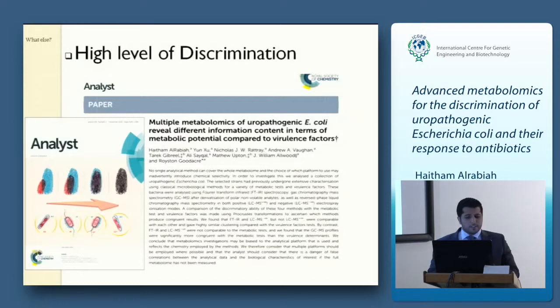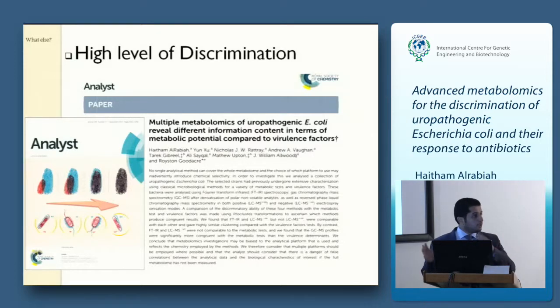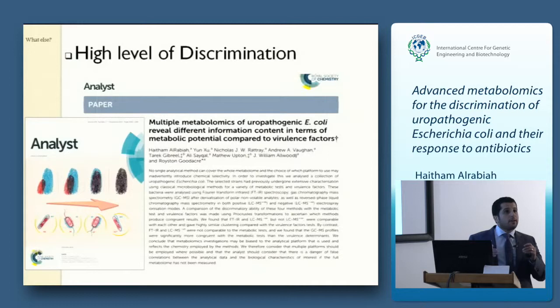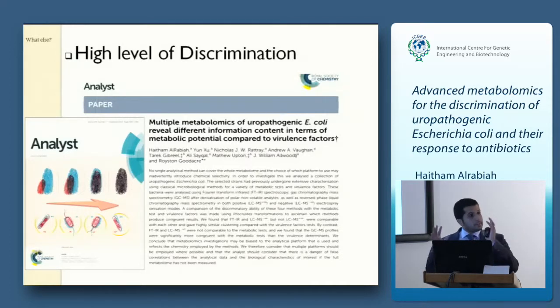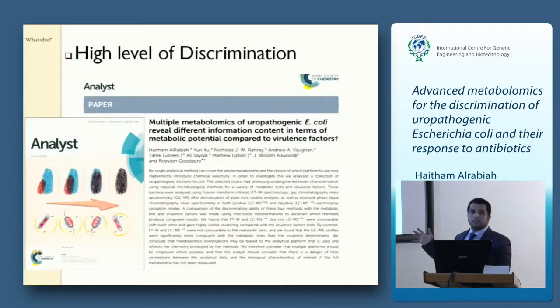These 11 isolates were comprehensively characterized in previous papers using traditional microbiological techniques like virulence factor tests and metabolic tests. So this gave us an opportunity to compare the results from the ordinary techniques with results from the analytical techniques that we use in metabolomics.